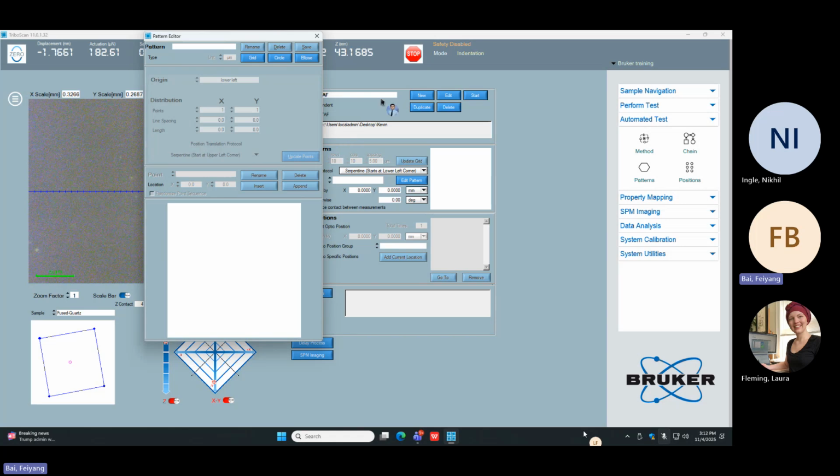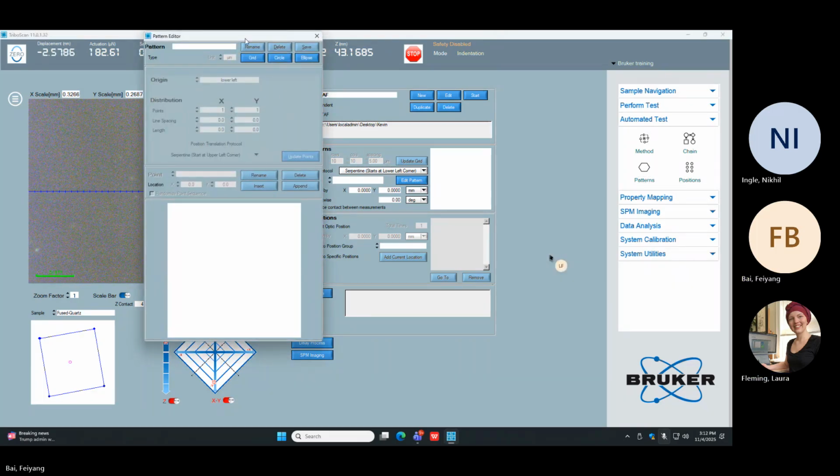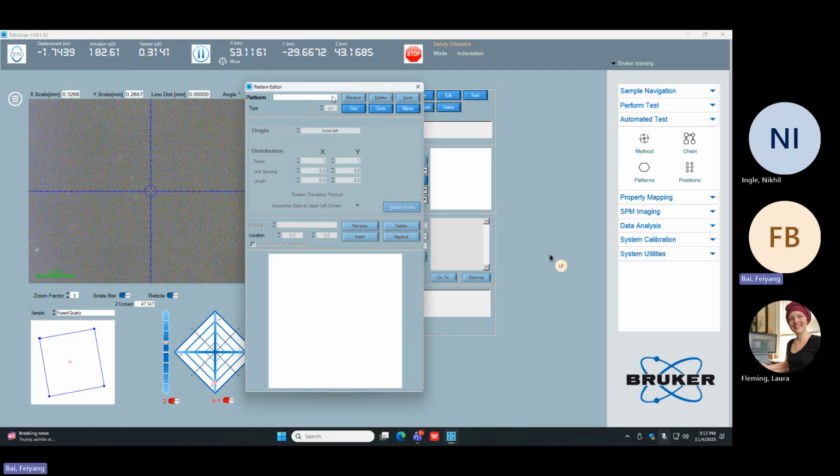I cannot. Can you close that? Oh, you can. Yeah. Huh. Okay, I'll let you click. That's strange. I've never seen that. Yeah, now I can choose. Earlier it didn't allow me. Weird, strange.